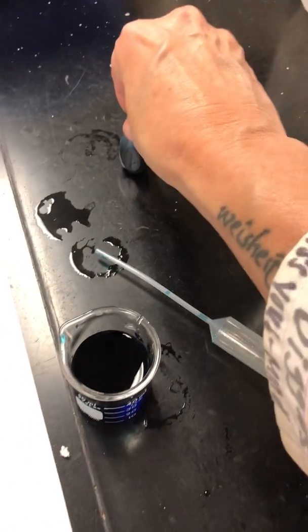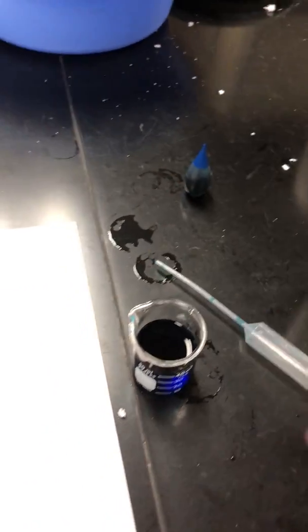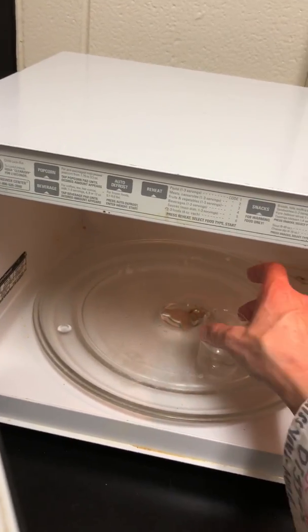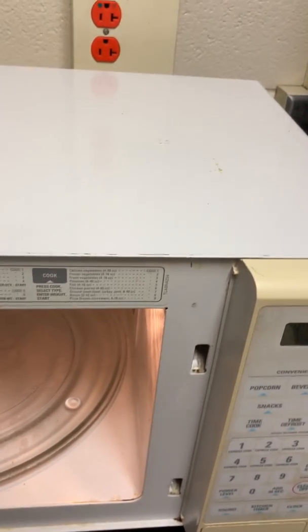Okay. We need our hot water. Ooh, yeah. Okay. Oh, I can't set it on the counter. Oh, that hurts. Okay. Sorry, be patient with me. 1 minute was too long.